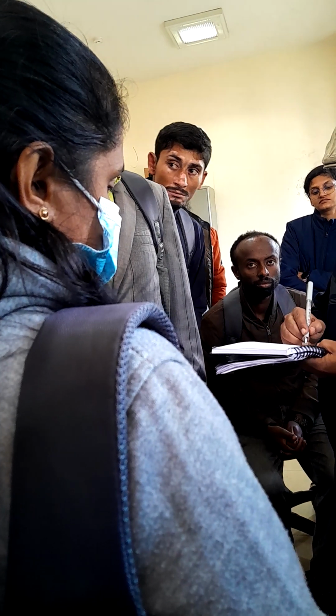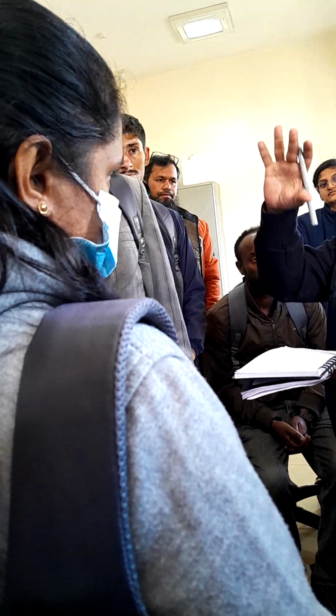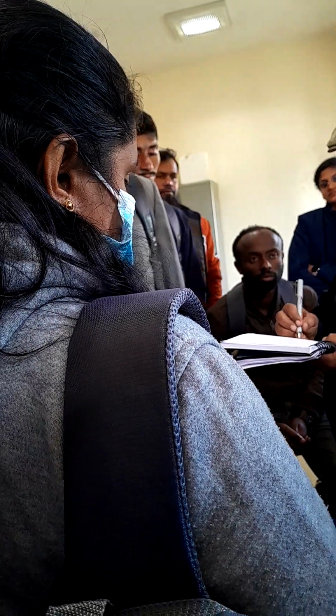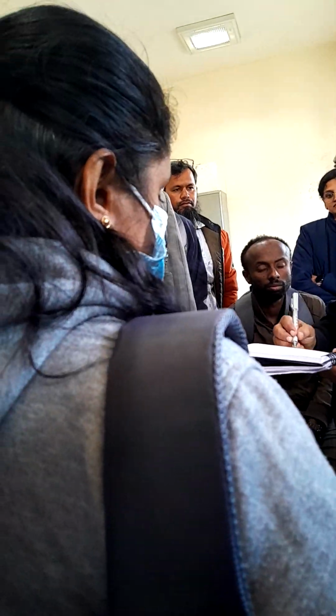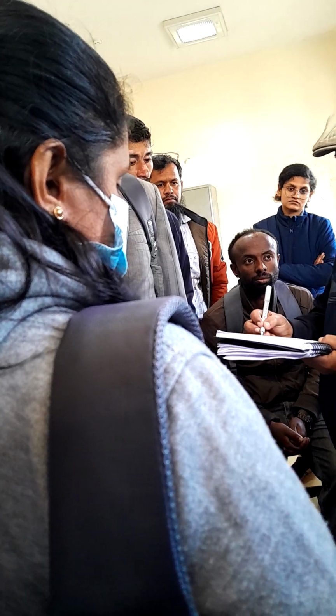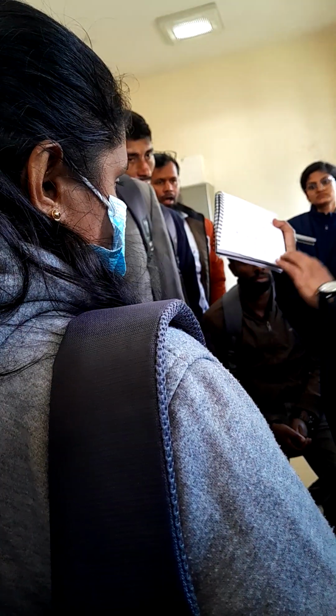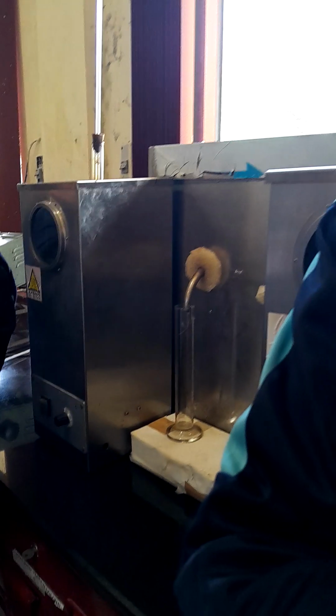Okay, and in D86 there are four groups: group 1, group 2, group 3 and group 4. Sometimes it has been asked, what do you mean by these groups? These are the four groups called ASTM D86.